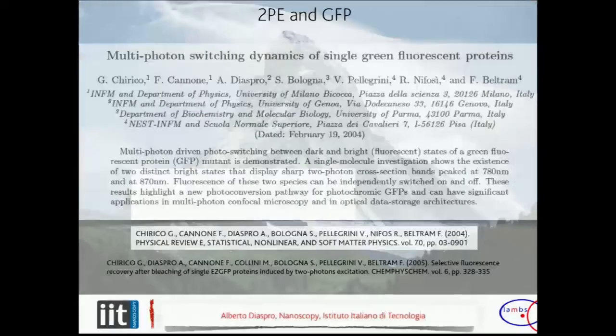And so now that you have this tool, you can start studying properties of single molecules in order to use them, for example, in advanced fluorescence microscopy. I will be back on this tomorrow, but let me go only until the end of this part fast, and then tomorrow I can discuss more about this, okay? If you agree.